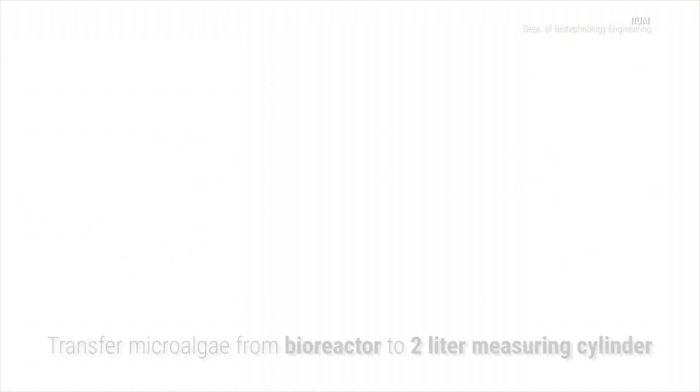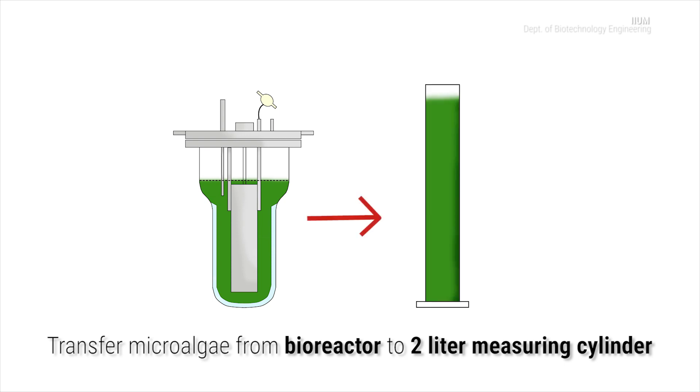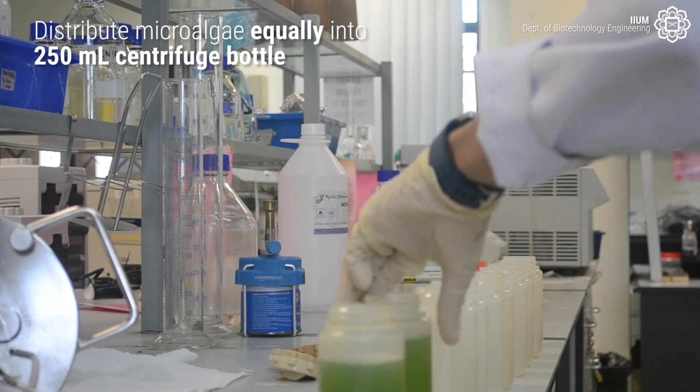For the harvesting process, transfer microalgae from the photobioreactor into a 2-litre measuring cylinder. Distribute microalgae equally into 250ml centrifuge bottles.